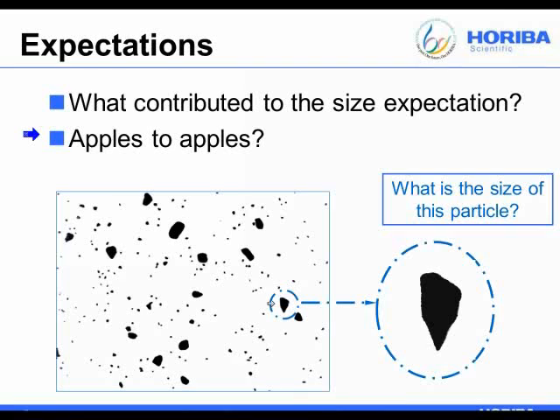The other thing that's important too is understand a little bit about the type of particle you're trying to measure. So the trivial case is you're measuring spheres, right? Every technology should measure spheres the exact same way because every dimension, every different way that particle can tumble, every dimension that's presented to the measurement is the exact same as every other dimension. That's the rarest application, unfortunately. Most of the time we get real samples that look like this.